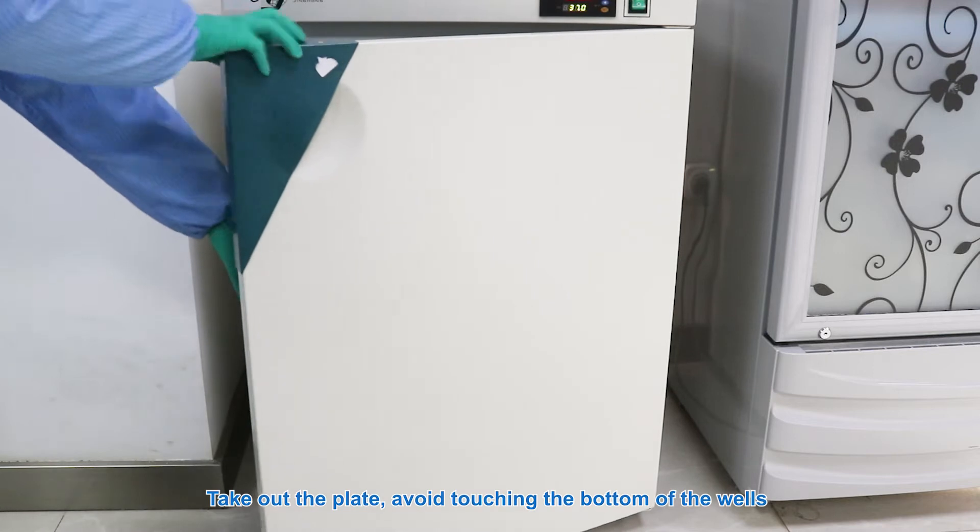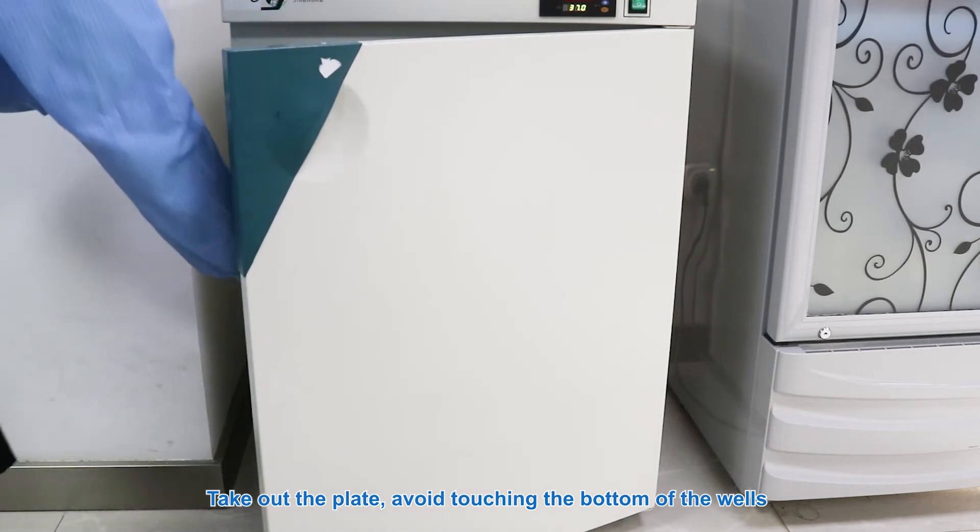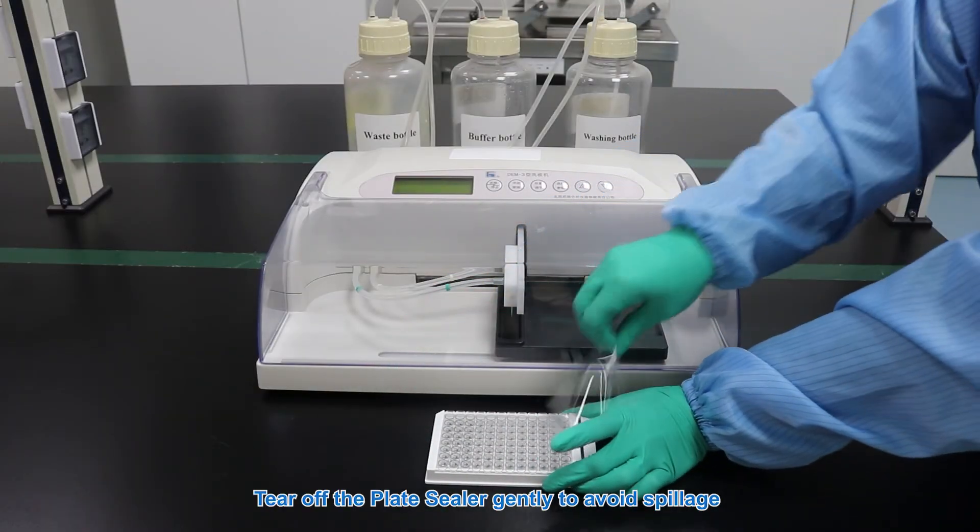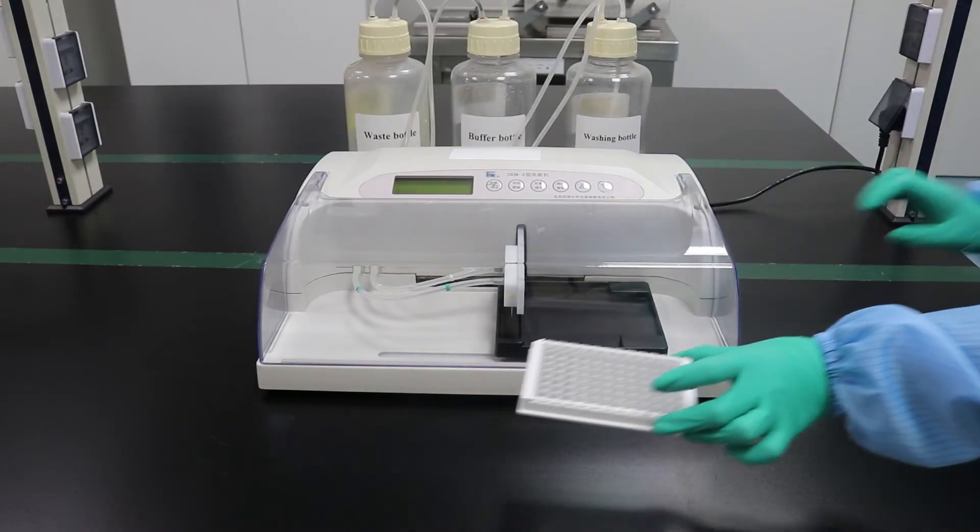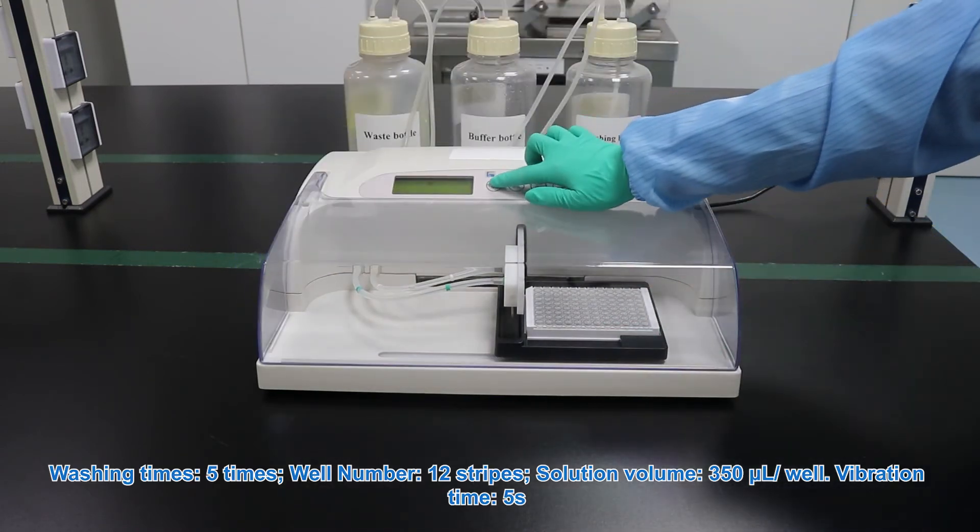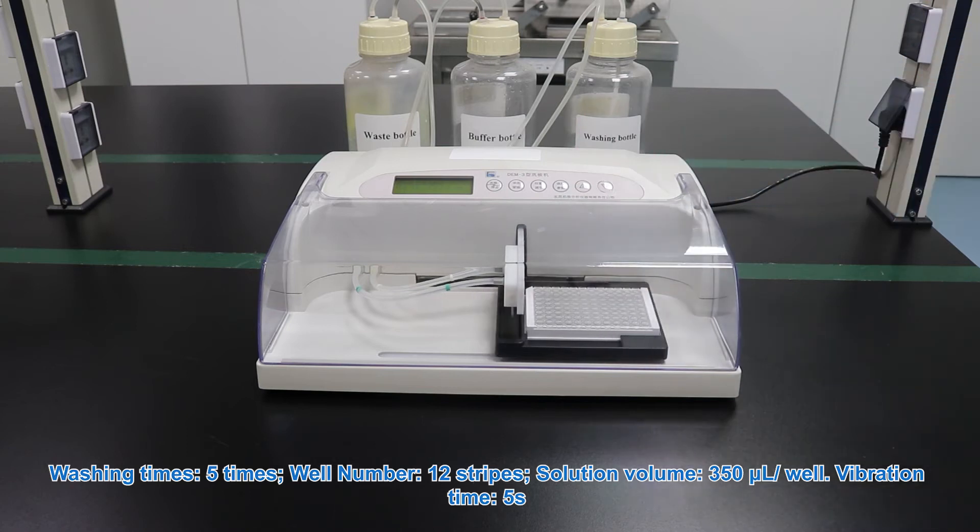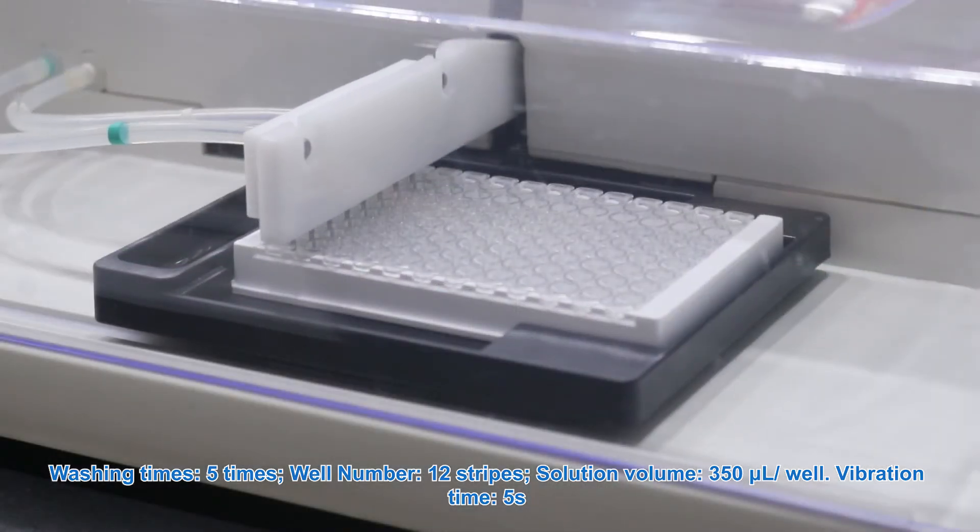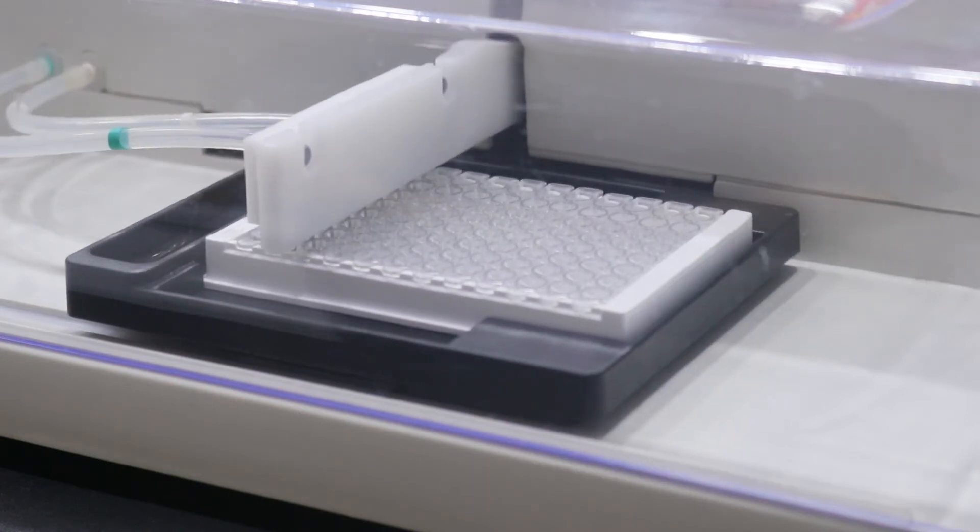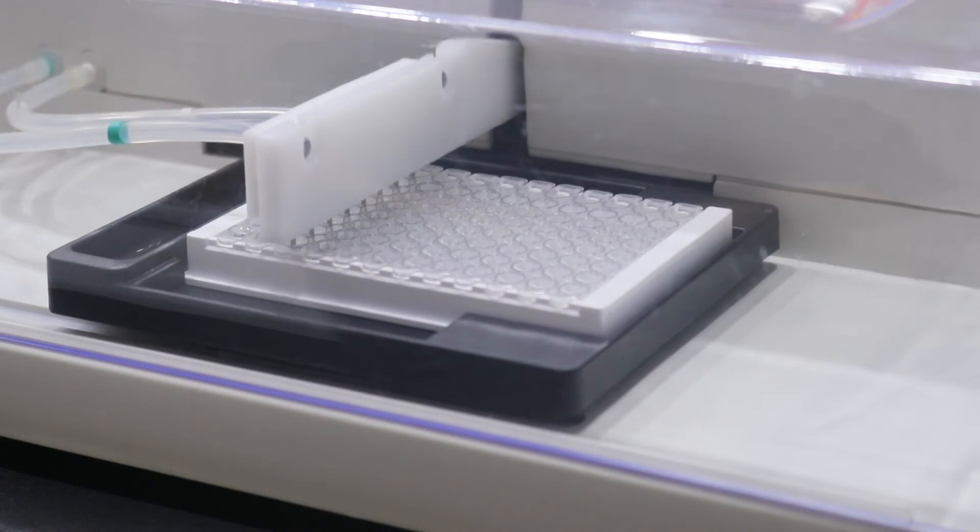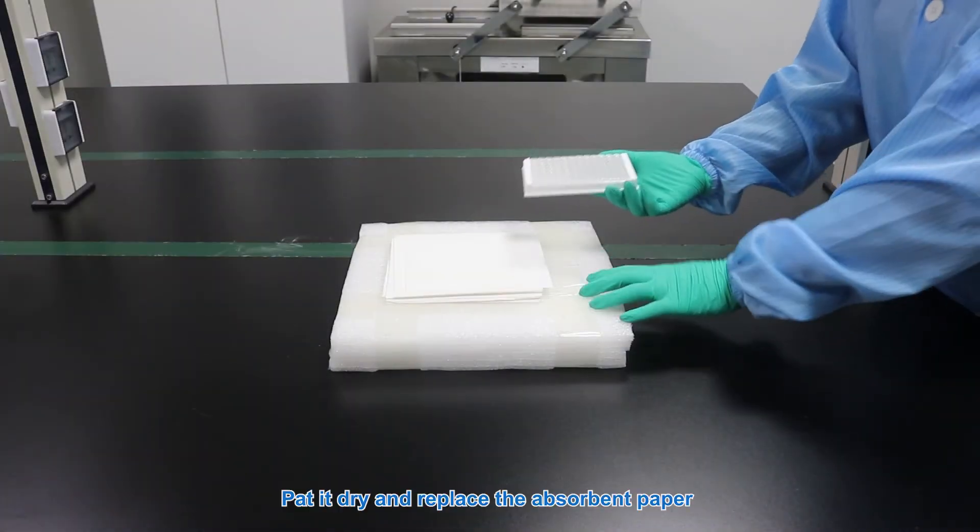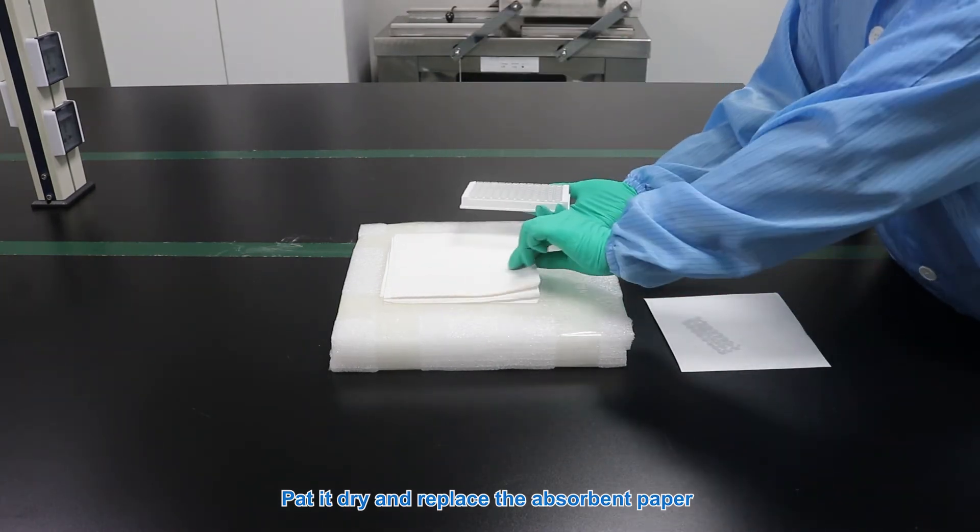Take out the plate. Avoid touching the bottom of the wells. Tear off the plate sealer gently to avoid spillage. Washing times: 5 times. Pat it dry and replace absorbent paper.